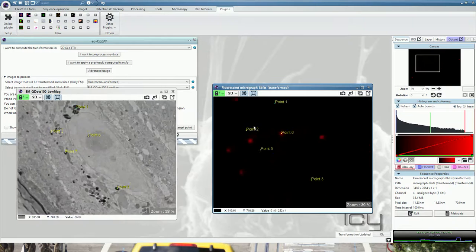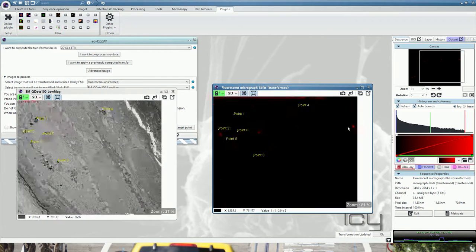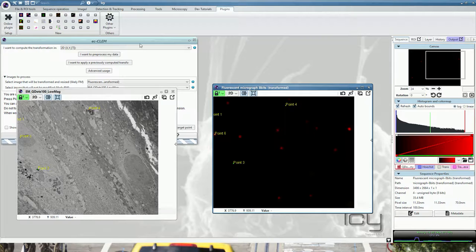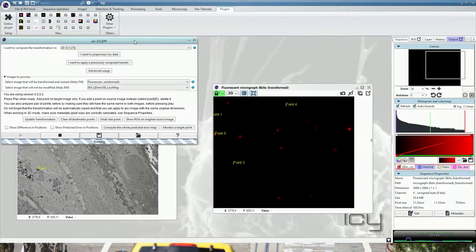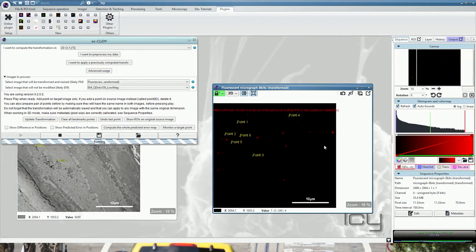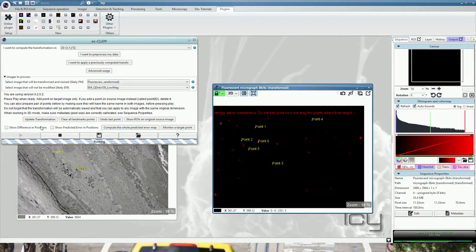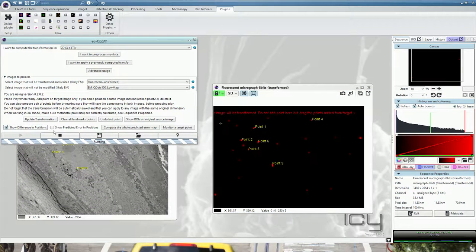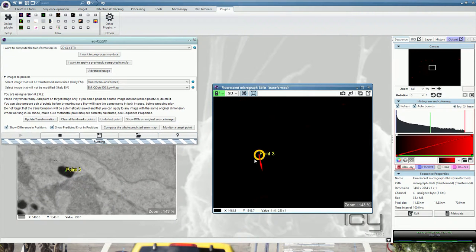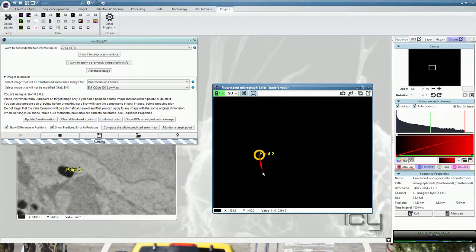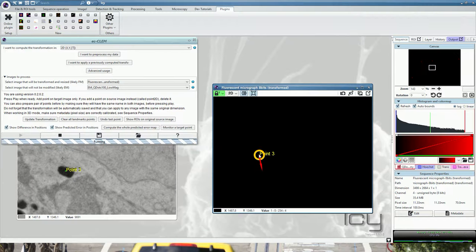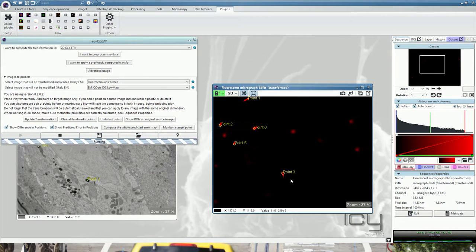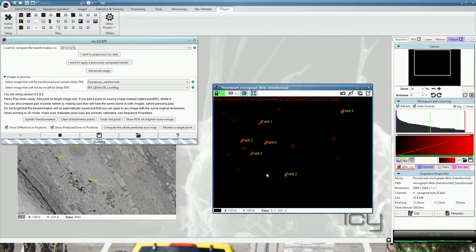Once you have placed enough points and you think you have a proper registration, then you can go into the EC-CLEM window and click the stop button. To be sure that your points have been accurately aligned, we have a show difference in position and a show predicted error system. When you zoom in, you can see now that we have an orange circle and a red arrow. The red arrow corresponds to the shift between where the point was placed by the computer and where you shifted it.